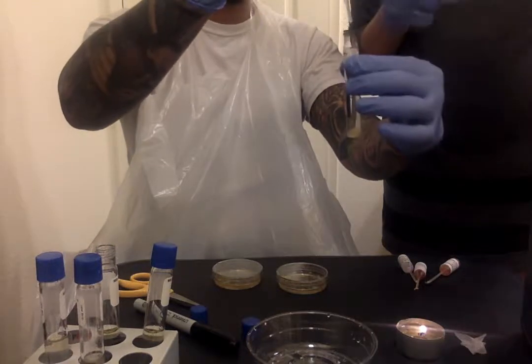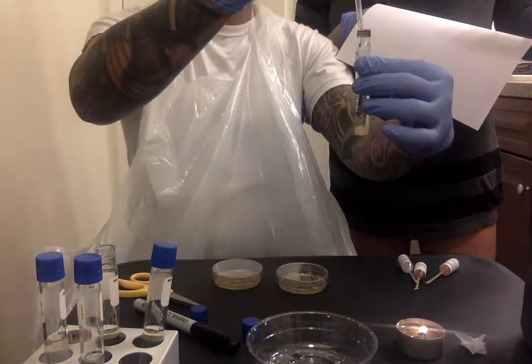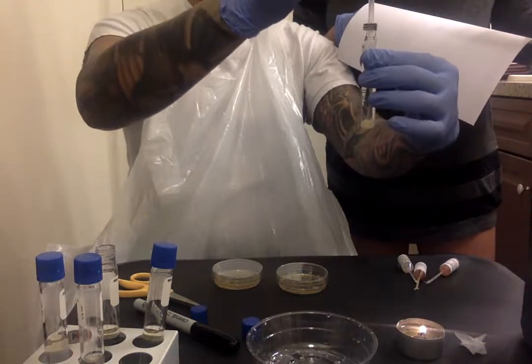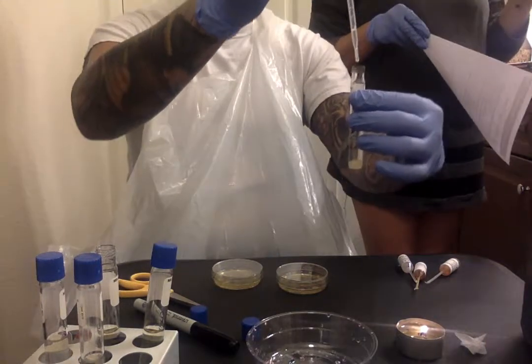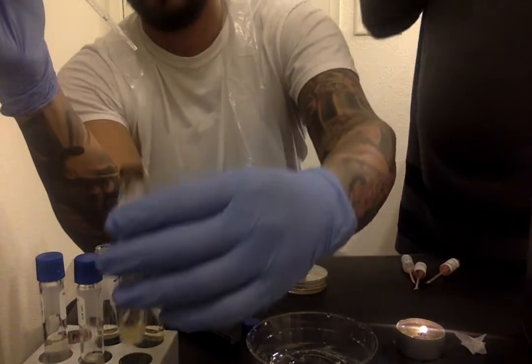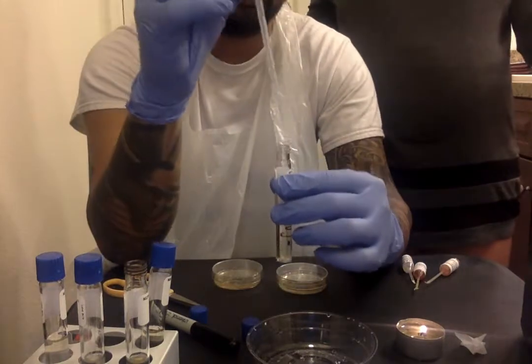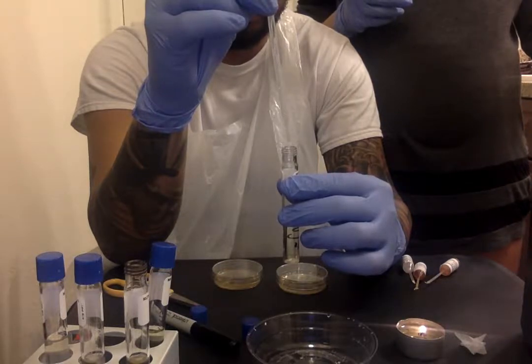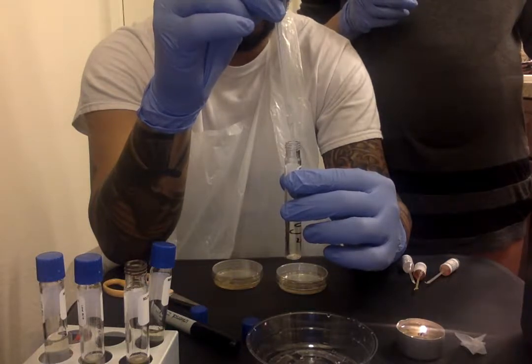That's the active E. coli. Yes. A small amount of broth — about four drops worth. Draw it a little bit more. That's about four. We're going to put it in — so put that back there and put it in the MRVP broth for E. coli. Drop four drops. One. Two. Three. Four. Good.